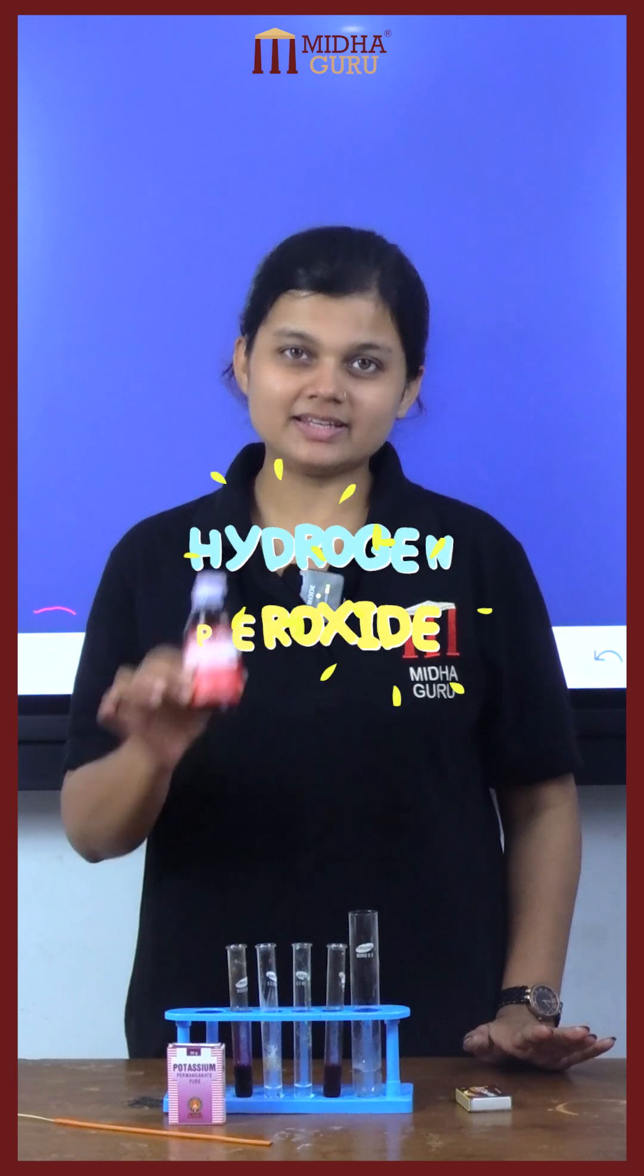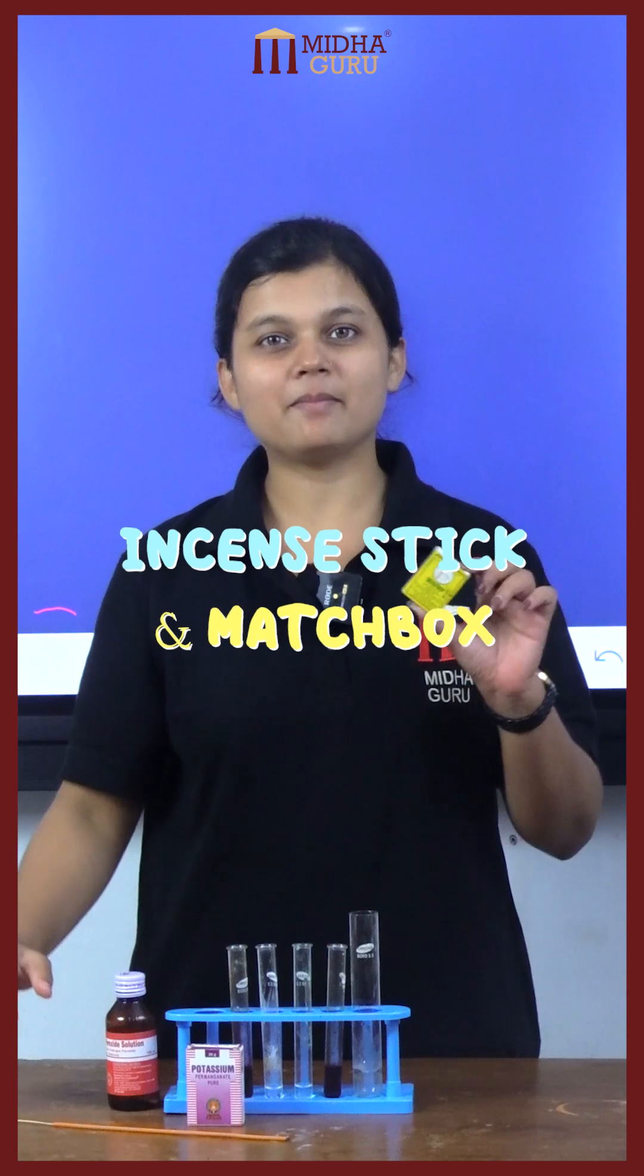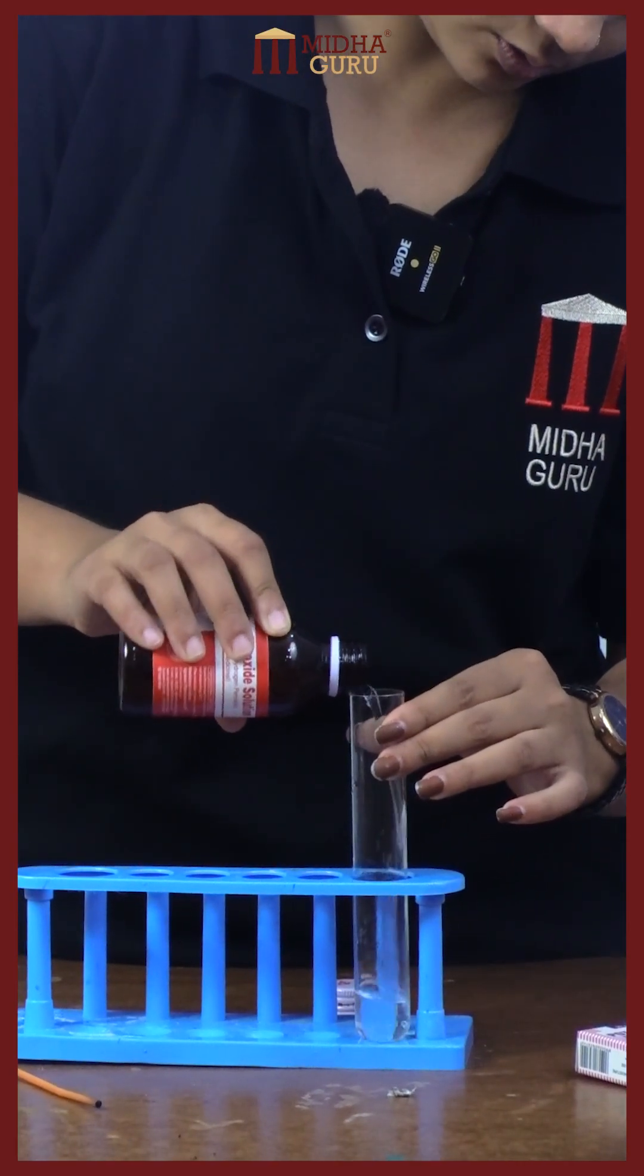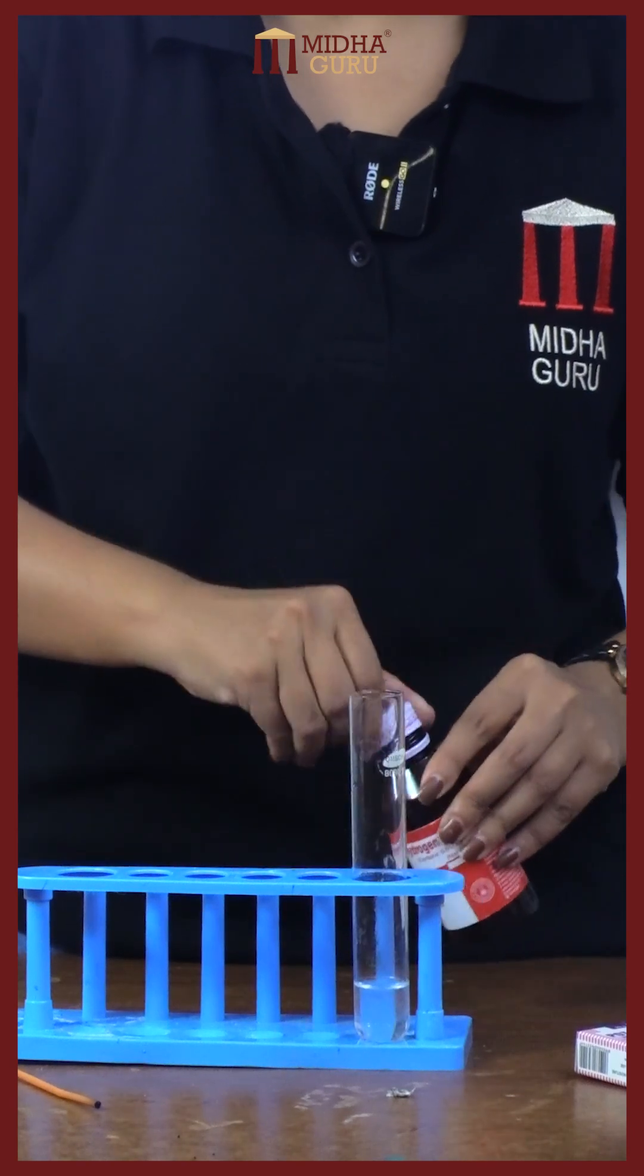Do you want to know how this happens? For that I need hydrogen peroxide, potassium permanganate, an incense stick, and a matchbox. Now I'm going to pour some hydrogen peroxide into the test tube and add some potassium permanganate to it.